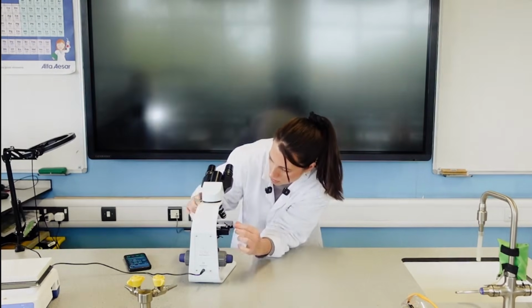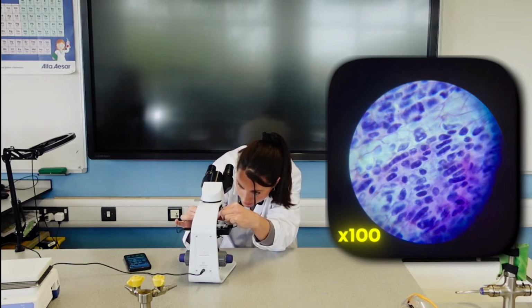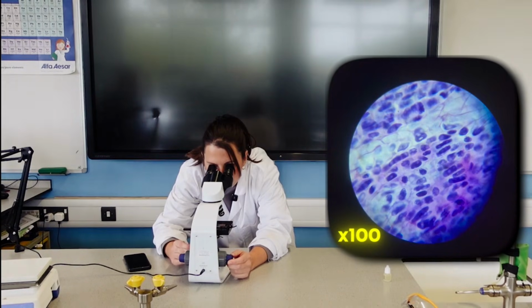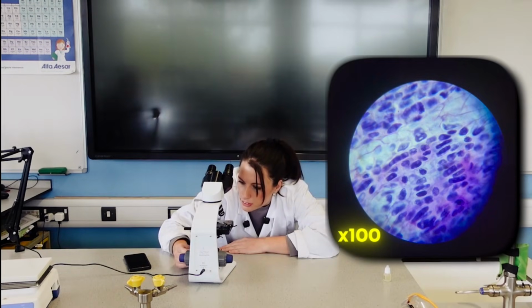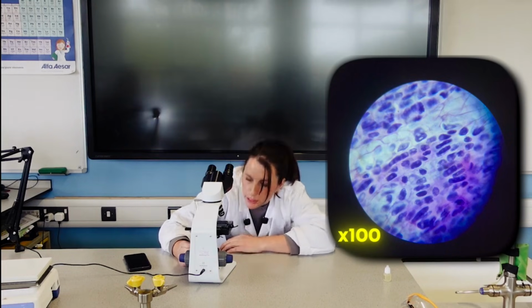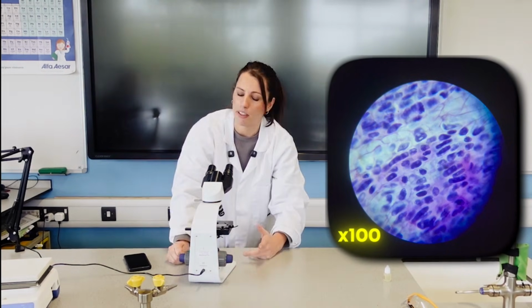I've actually got one here that goes up to 100 times. So let's just move that in place. I've actually lost the position of it now. Let's get you back. Oh, it's over there. Okay, so go this way. And then if I go backwards, it should be bang under now. Yeah, there we go. I suppose I should say that's a tip rather than just saying it out loud.